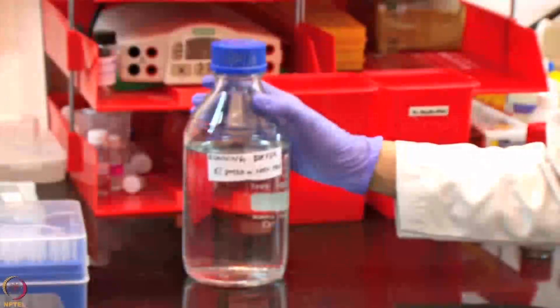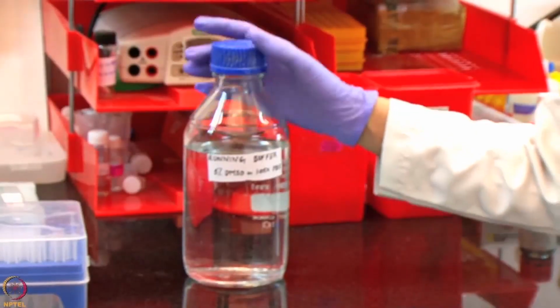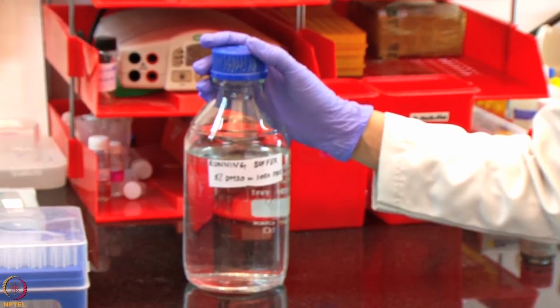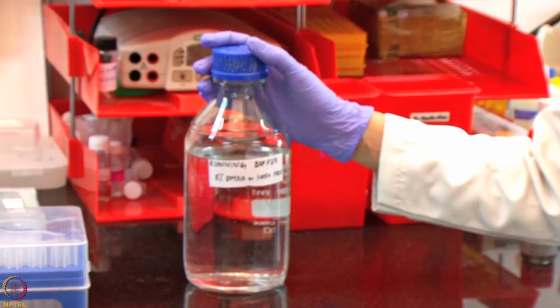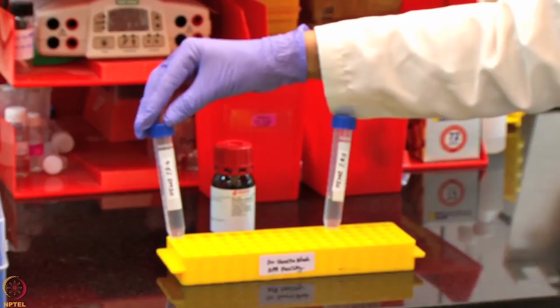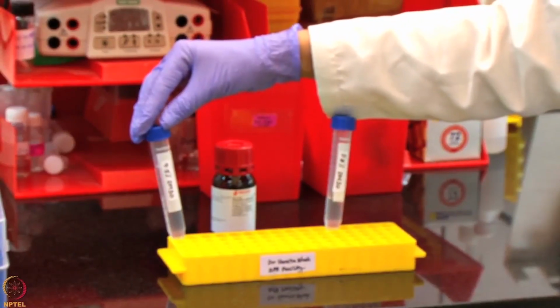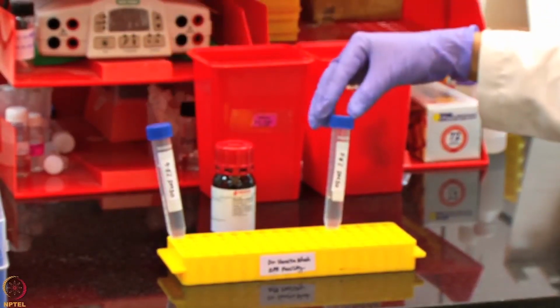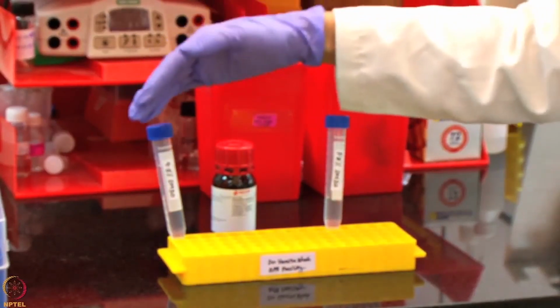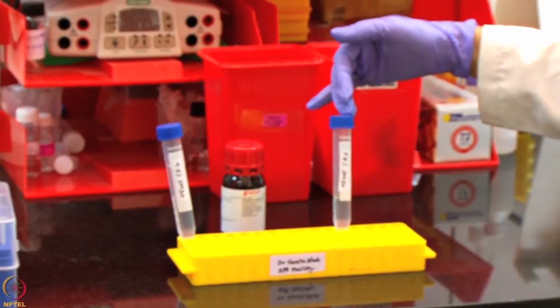In this study, we will again be using 5% DMSO in 1.05x PBS as the running buffer, which will also be used for the initial startup cycle. As prepared in the screening assay, we will again prepare 8 different solvent correction solutions ranging from 4.5% DMSO in PBS to 5.8% DMSO in PBS by mixing these two solutions in different ratios.